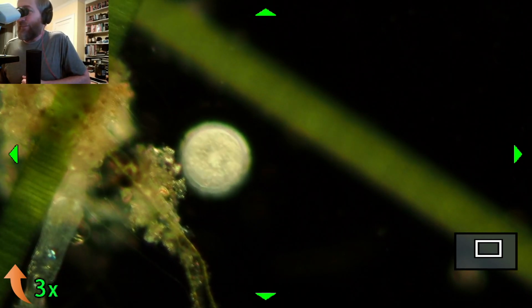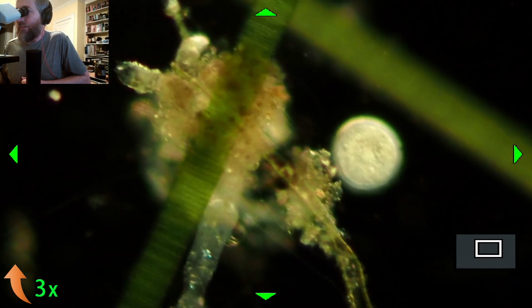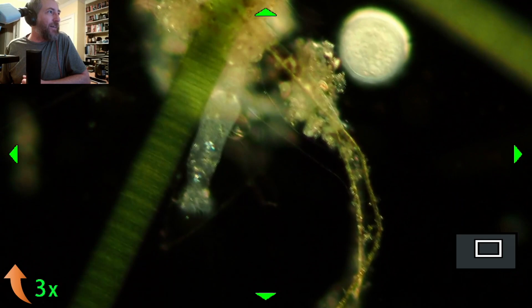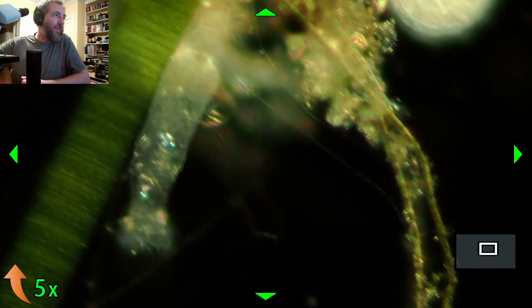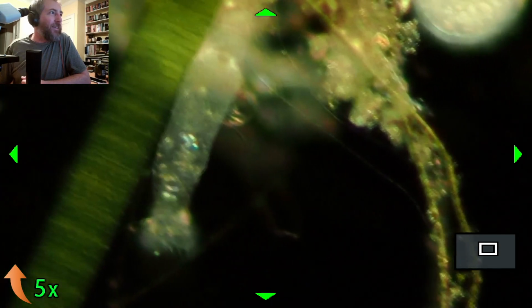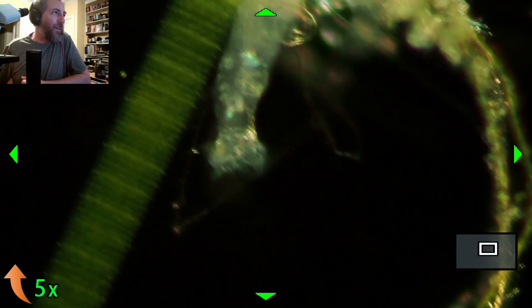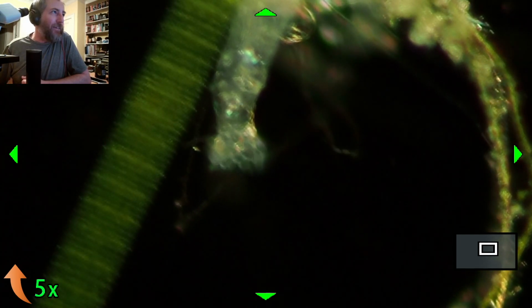And this is the way this thing was spinning when we first came to it. It was just sitting here making a circle. That thing to the left of it is actually a rotifer, not a slug. And it is also spinning its cilia, which are out here. Give me a second. We'll zoom in and take a look at it as well. It's got its own little mesmerizing going on. Like a little vacuum cleaner.